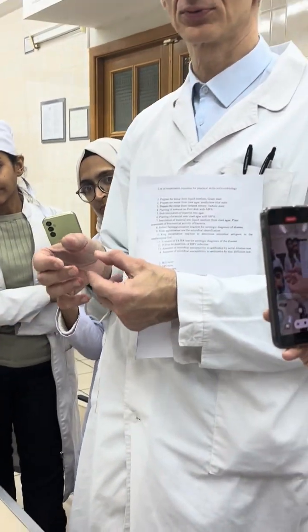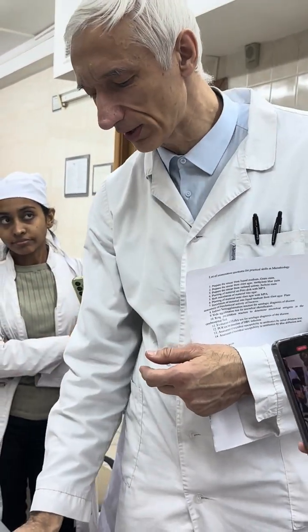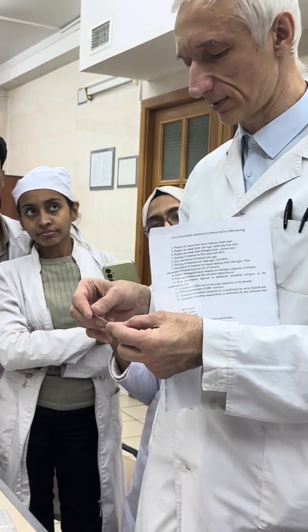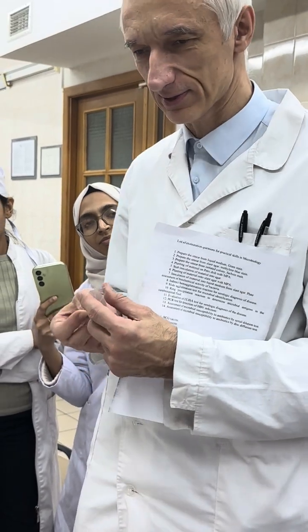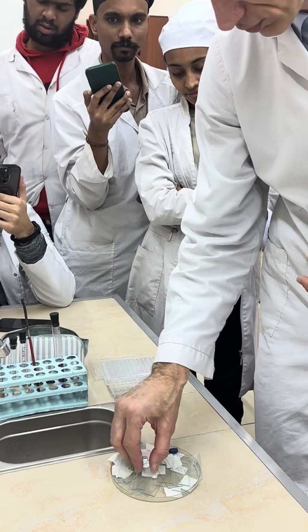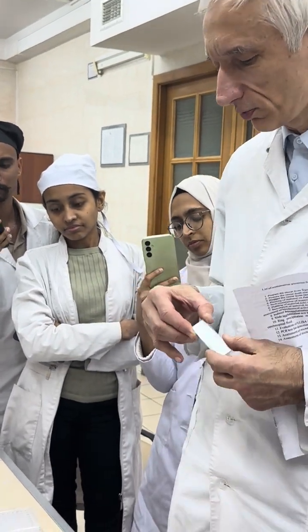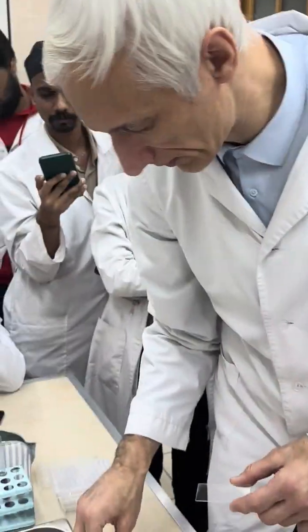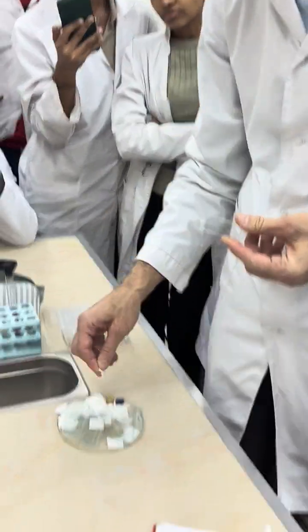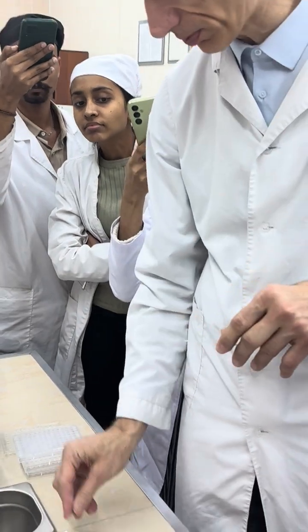So people, I recommend you use this one because students are nervous. Everything goes sometimes poorly, and especially if they press something a lot, they may easily break the slide. I will make some notes into my papers. This slide is really difficult to break. Of course, you choose the clearer slide. There are enough choices. So taking this one, remove the extra dust as usual, then limit the area of your slide like in drawing holes and so on.